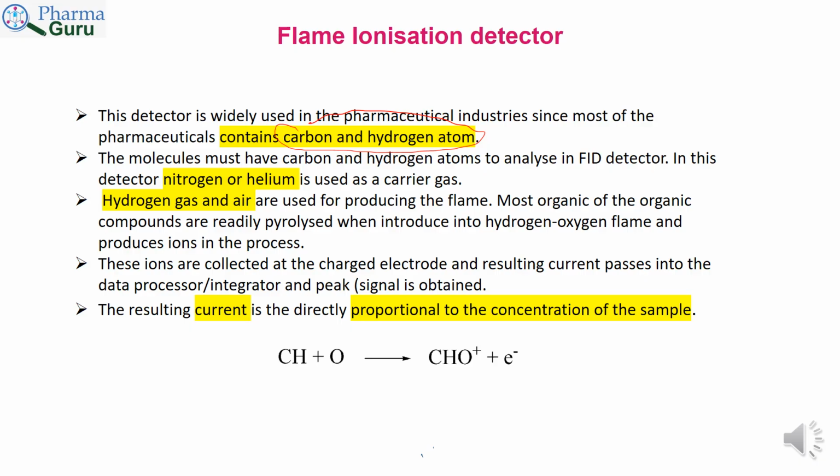Secondly, which has oxidizable carbon atom. Nitrogen or helium is used as a carrier gas while using FID detector. Response is directly proportional to the concentration of the sample.